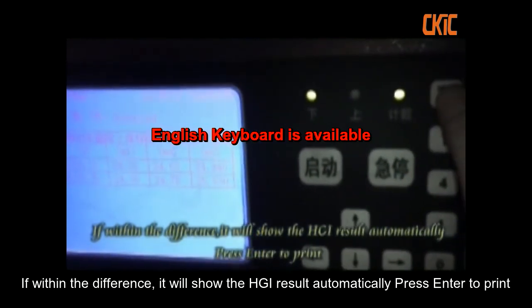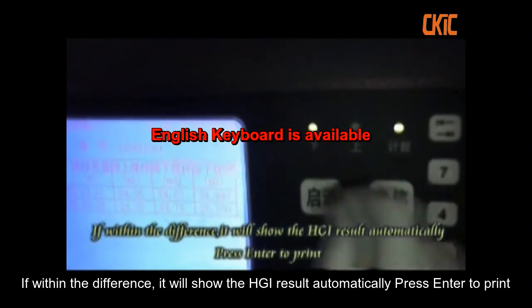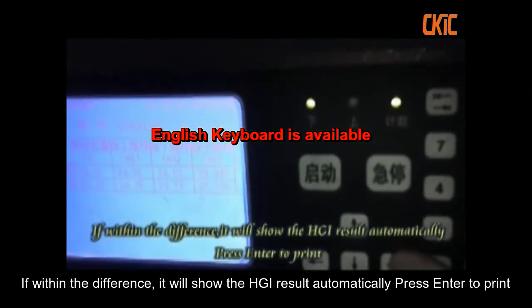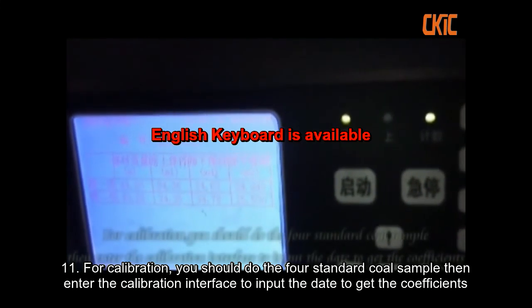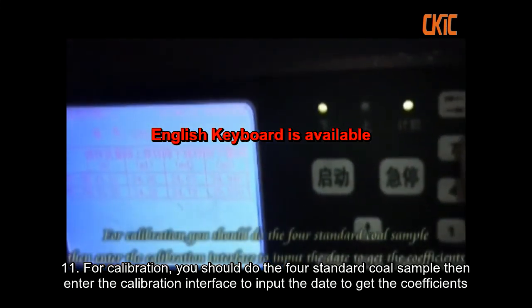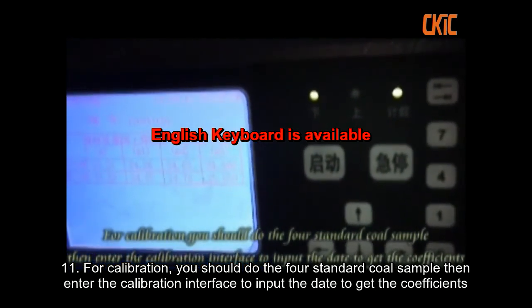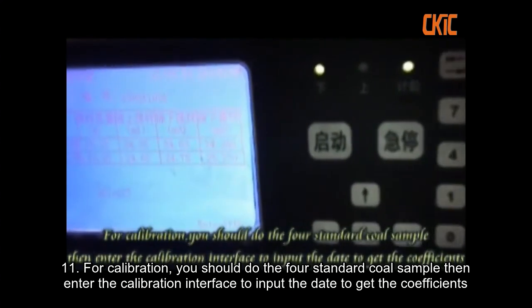Press Enter to print. For calibration, you should do the four standard coal sample, then enter the calibration interface to input the data to get the coefficients.